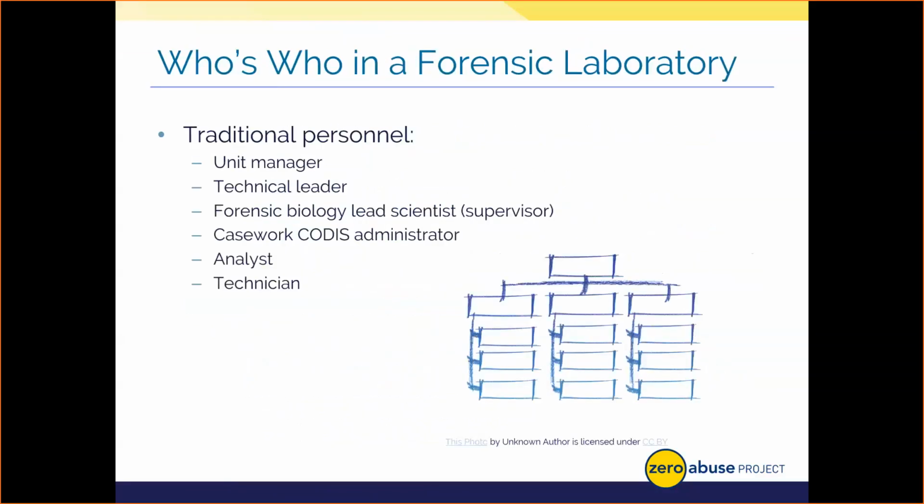Now let's go ahead and talk really quickly about who's who in a forensic laboratory. And the reason I want to talk about this, right? From your unit manager, who oversees all of the units across all regional labs, all the way down to the technician, there is a hierarchy in your lab. So when you are concerned about how a testing method is used, or you want to try something new and outside of the box, what you'll find is that your analyst is near the bottom of this hierarchical chain.